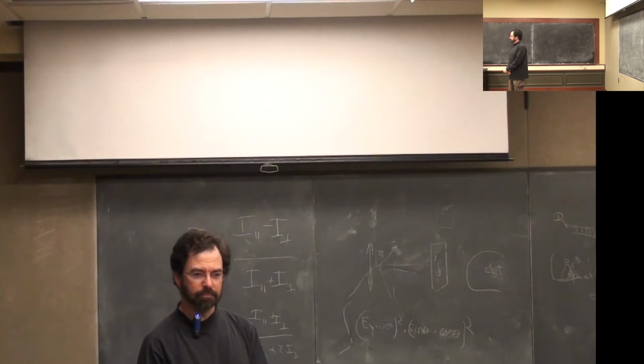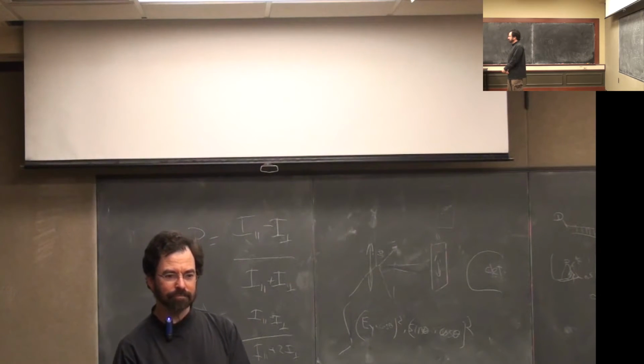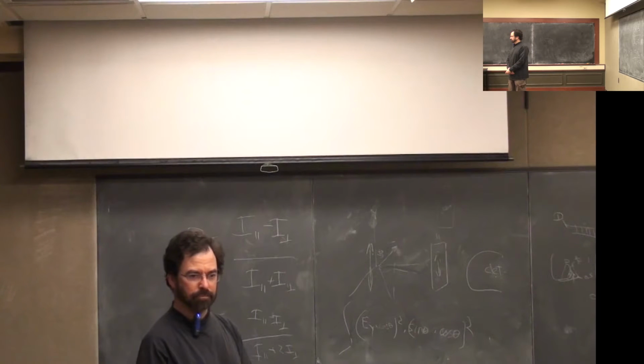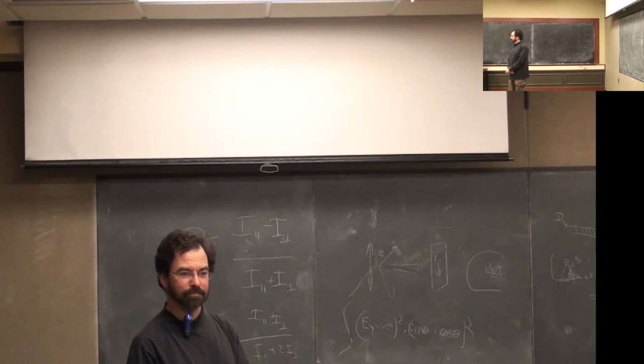So I think I'm confused. Okay. So when kappa is 0, the donor is like this and the acceptor is like this, and they're not moving? And they're not moving. Oh. So it's not moving. So when it's 4, they're both in the same plane and also not moving. That's right.